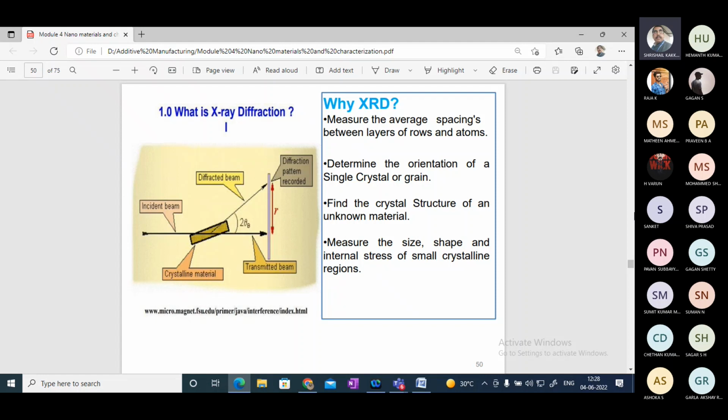Another thing: if you slide over the surface of this tool, the tool surface preparation is not that important here. Once you slide over the tool, what happens? It gives you the average dispersion of the elements. For example, the first test I did I had 3, the second test 4, the third test 3.